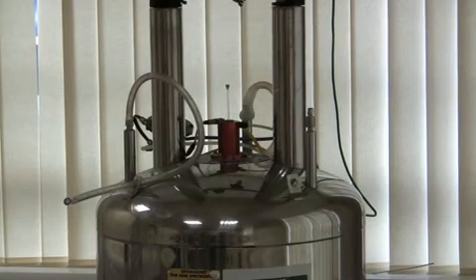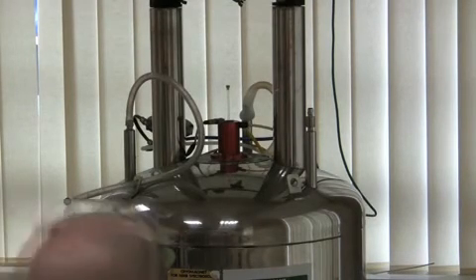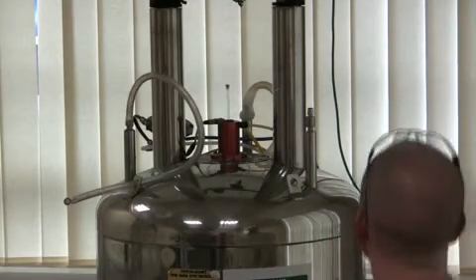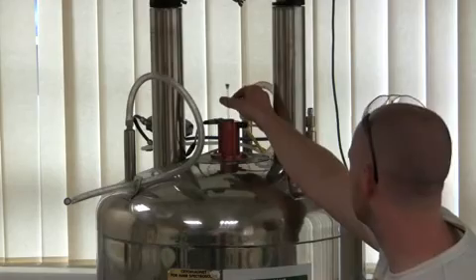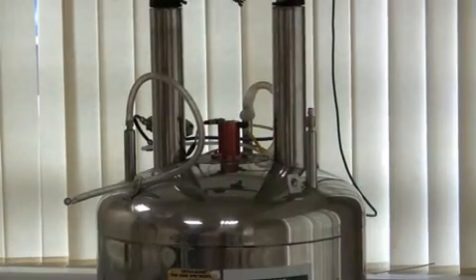The sample is then removed from the NMR spectrometer by raising the spinner using compressed air again, so that other users can run spectra of their own.